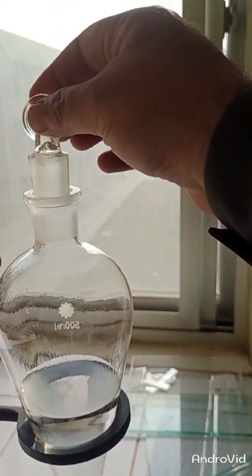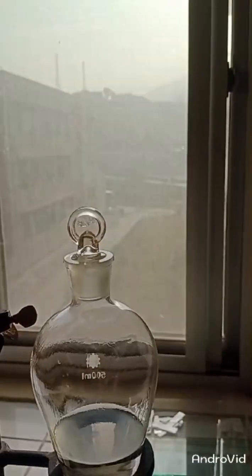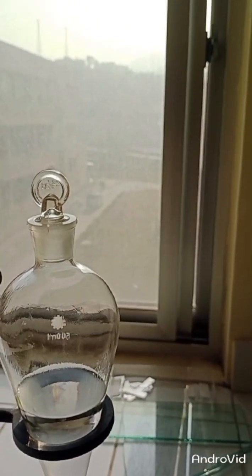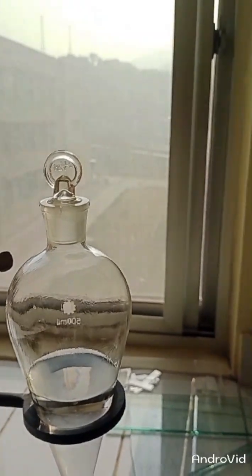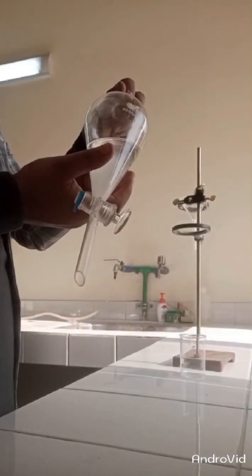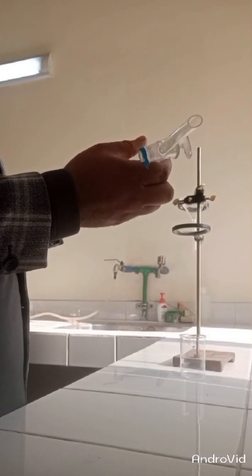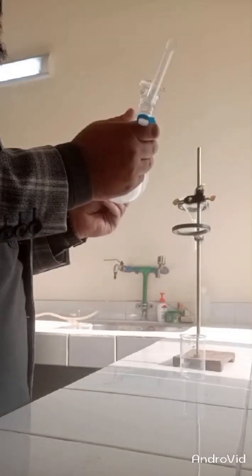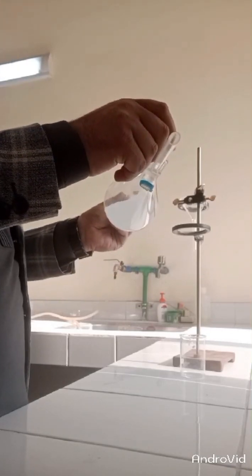After adding the solution and the product, I have to put the stopper on the separating funnel, and then I have to shake it to remove all the carbon dioxide that will be collected during this process. After adding our product, we have to shake this separating funnel very well, making sure that both stoppers are tightly fitted. Remove the carbon dioxide continuously.